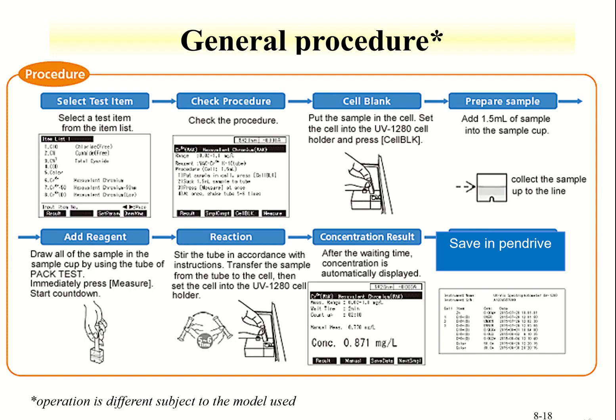Here are the steps to perform a sample scan and save the data from the equipment.